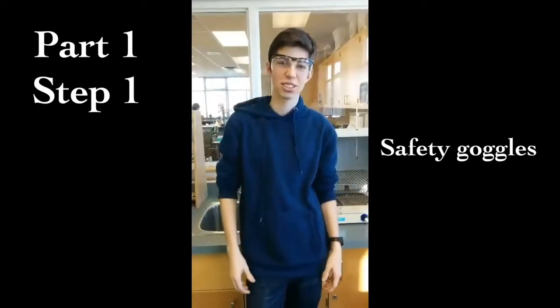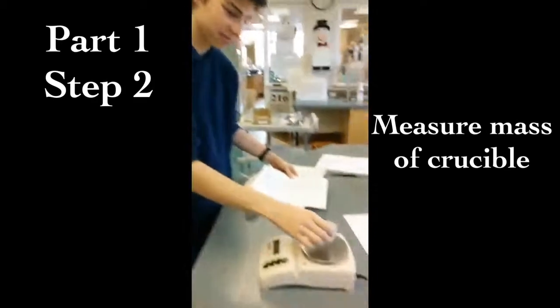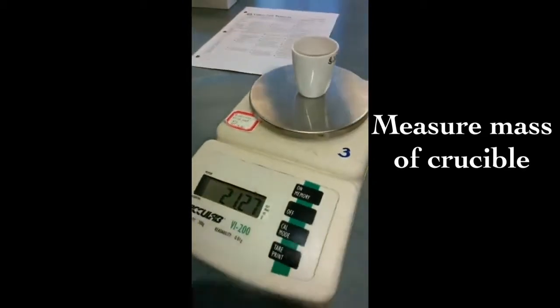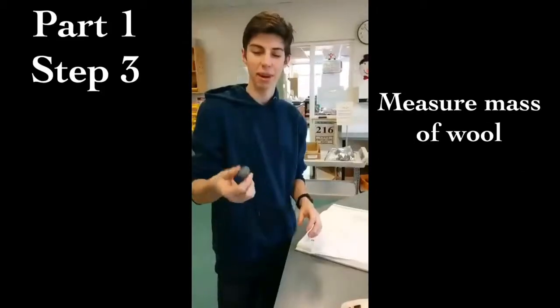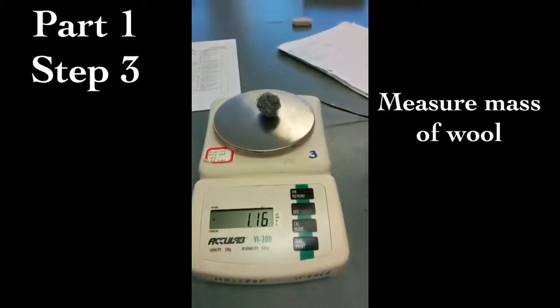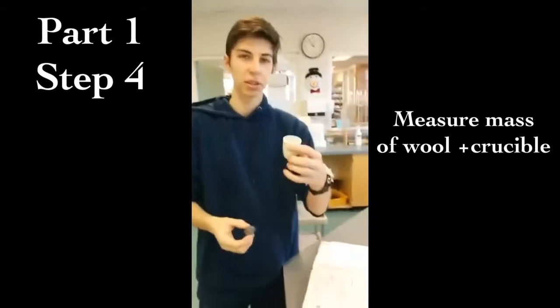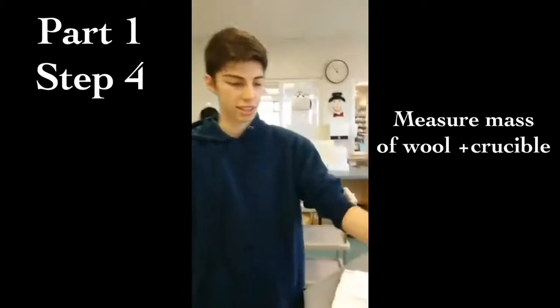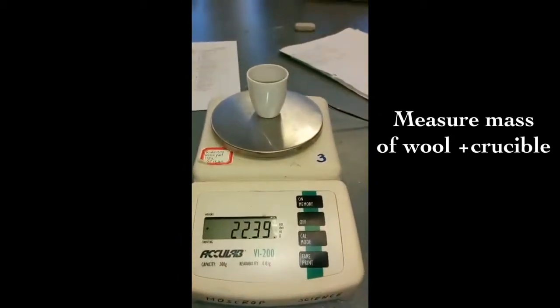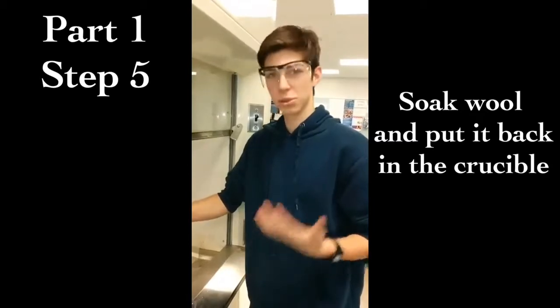Put on your safety goggles. Now we'll be getting the mass of the crucible. 21.27 grams. Now find the mass of the steel wool. 1.16 grams. Press the wool into a little bowl in the crucible. Let's weigh it. 22.39 grams.